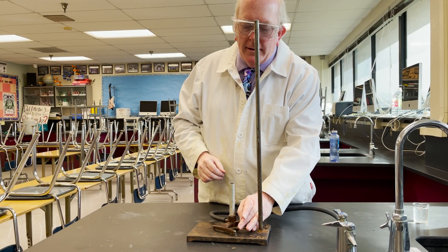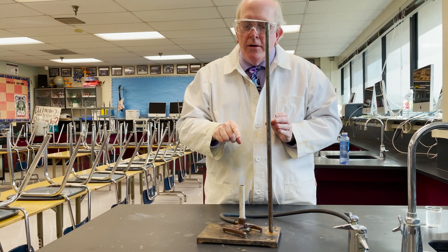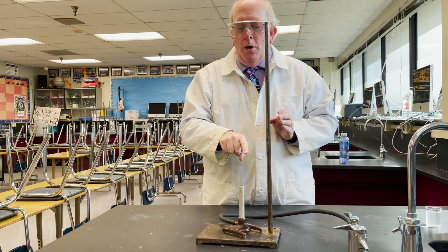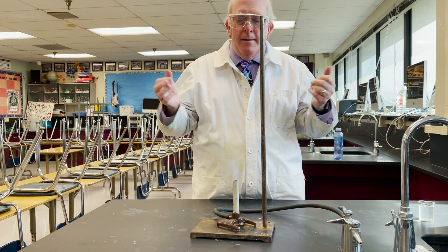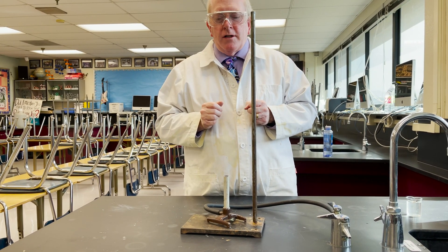Halfway open, you get that good sound, and what you can see inside the flame is a nice blue cone, and that is the hottest part of the flame. So if we're using this for something like flame tests, that's where you're going to want to put your sample — right there in the hottest part of the flame.